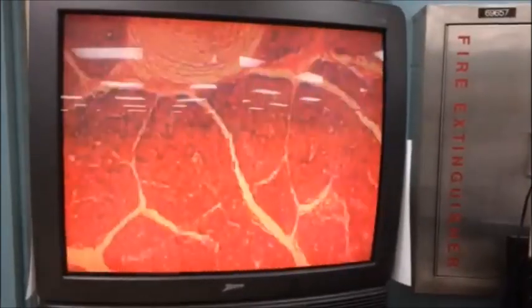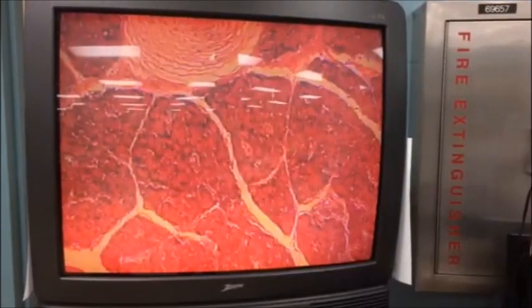So I'll show you what I mean. I'm wiggling the mechanical stage as I slowly move the focusing knob to make the stage go down. Oh, there, I went too far. See how that gets the object in focus?